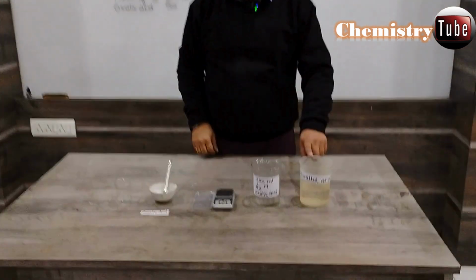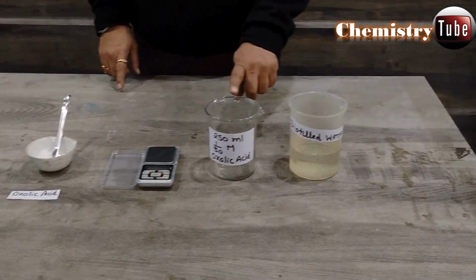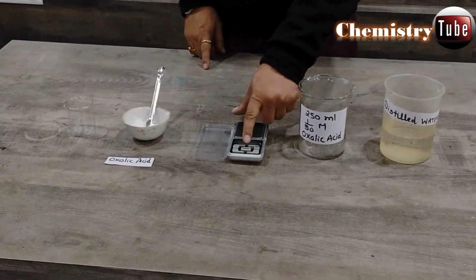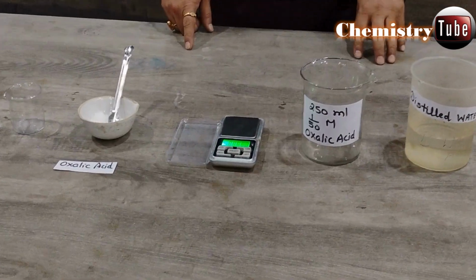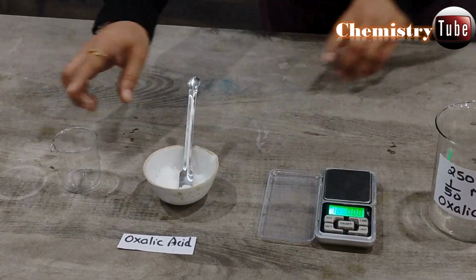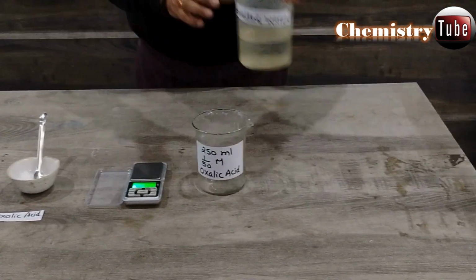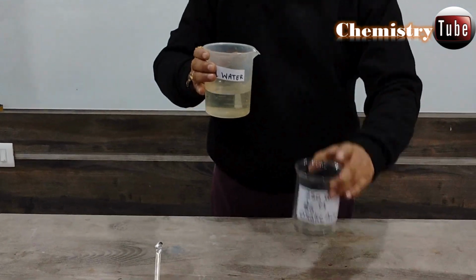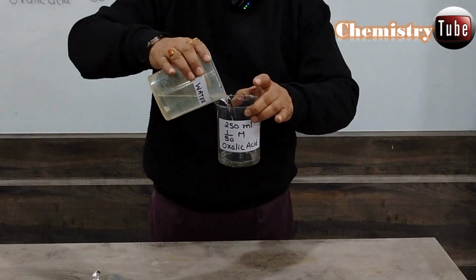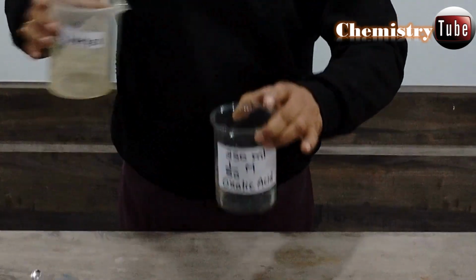To prepare 250 ml of 1/50 M oxalic acid solution, we require certain things. First of all, we require exactly 250 ml of distilled water. We require an empty beaker. We require an electronic weighing machine. This is the oxalic acid that we have to weigh, and we require a small beaker. Now the first step is we transfer this 250 ml of distilled water into this beaker. Now we have 250 ml of distilled water in this beaker.